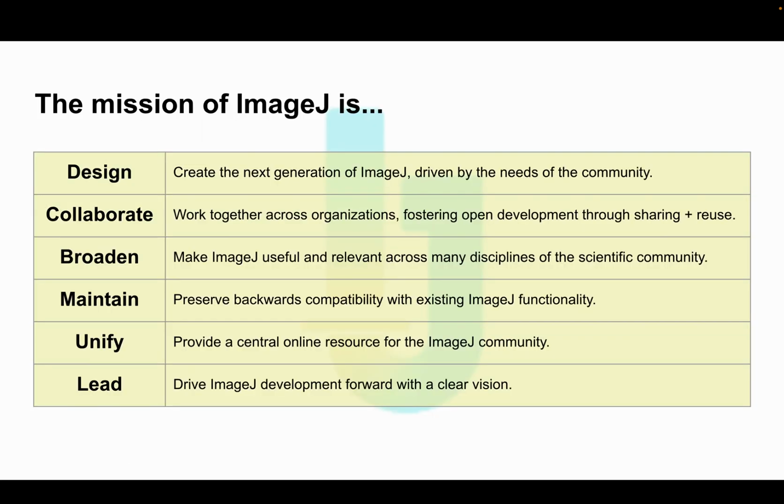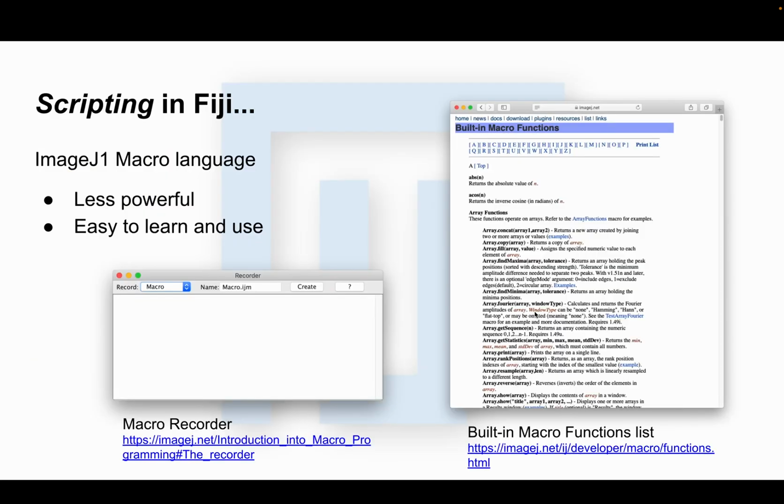We're really not going to go into too much more detail on scripting in Fiji. Again, there is a whole workshop that's available just on scripting, and tons of resources on the wiki. So go to imagej.net/presentations, and you'll see that there are workshops on scripting as well.